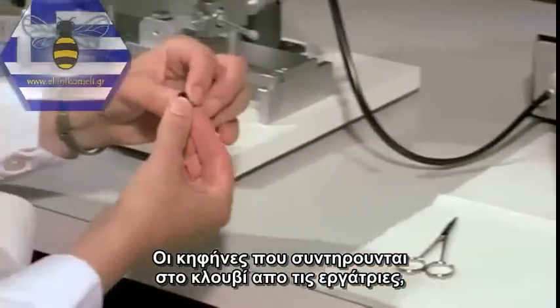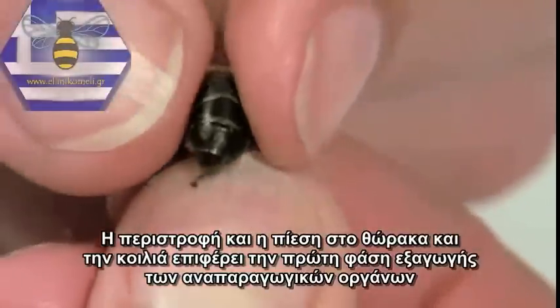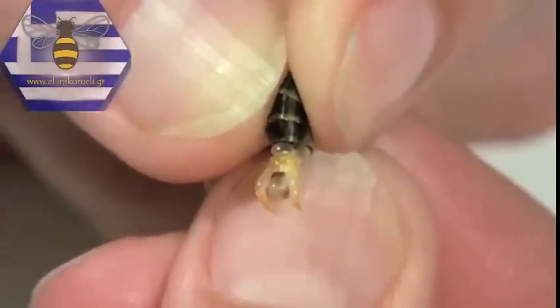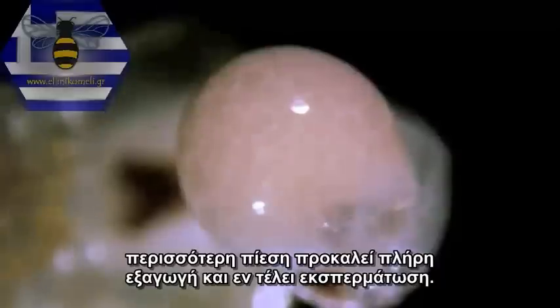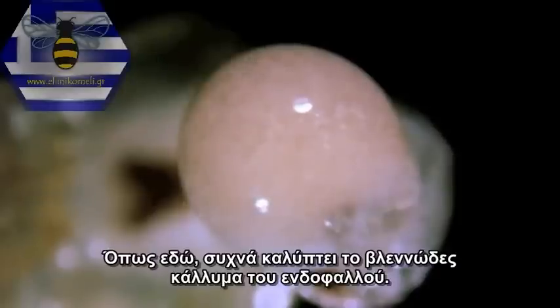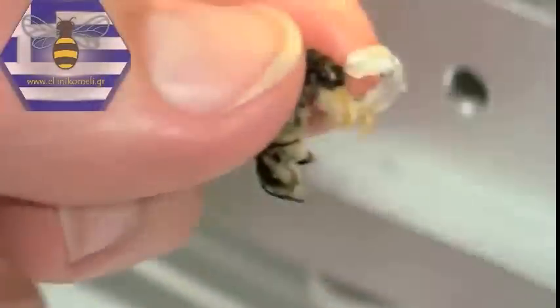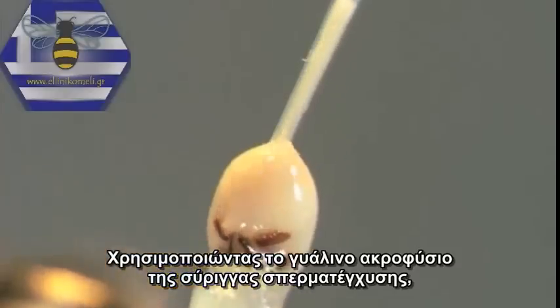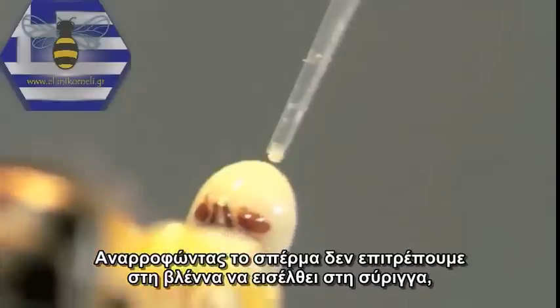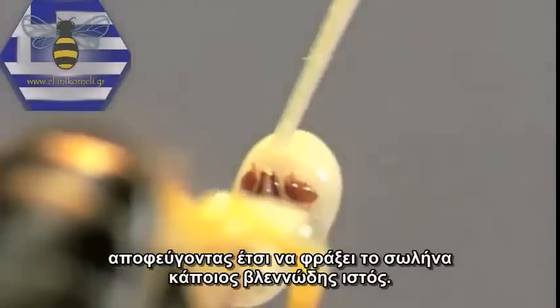Drones which have been reared in cages by workers are used as semen donors. Rolling and pressure on the thorax and abdomen effect the first phase of eversion of the copulative organ. Further pressure results in complete eversion and ejaculation. Mature sperm is cream coloured and marbled in appearance, and it often covers the white mucus plug of the endophallus. Using the glass tip of the insemination syringe, merely touch the surface of the semen covering. In aspirating the sperm, none of the mucus should be allowed to penetrate into the syringe, thus preventing the cannula from becoming obstructed by a mucus plug.